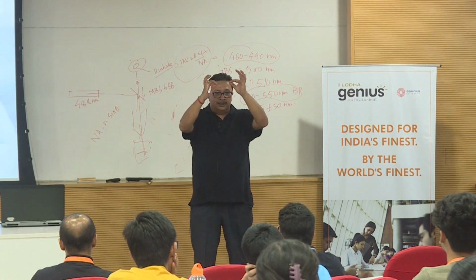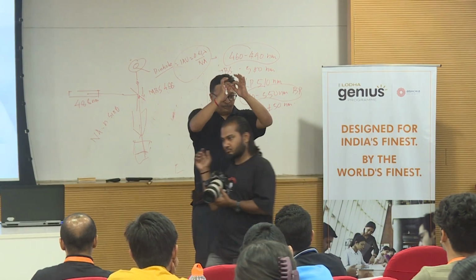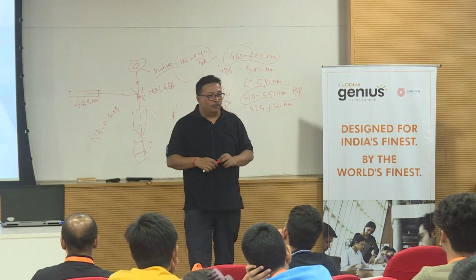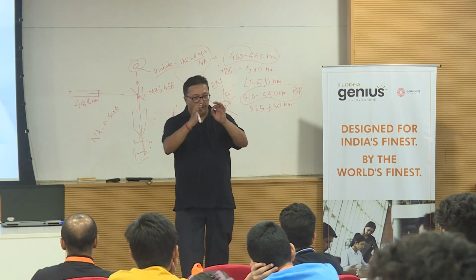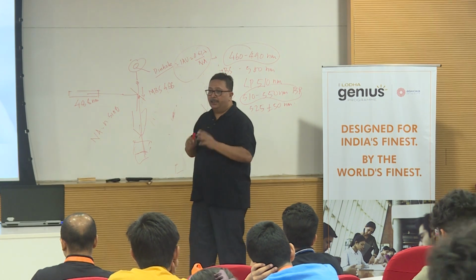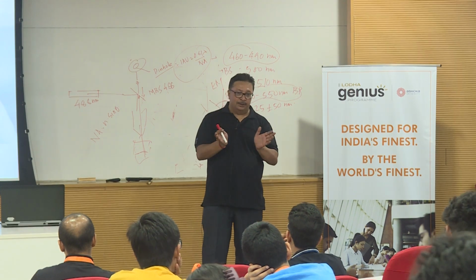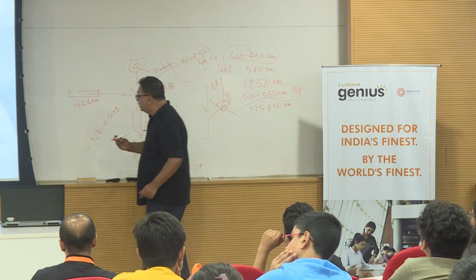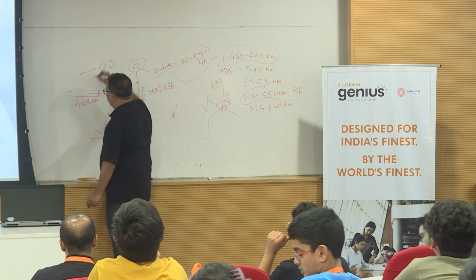No. This 2 dots I can image and resolve it as 2 dots or 2 images until this point. The time it gets overlapped, you go beyond the diffraction limit, and you cannot resolve it. So up till here it is resolvable. Beyond this it is not resolvable. So the ability of a system to resolve 2 dots as 2, or 2 points as 2 points, is what you define as resolution. Okay? So it means that if I say 2 dots over here, try to image it, this is how I will get an image.